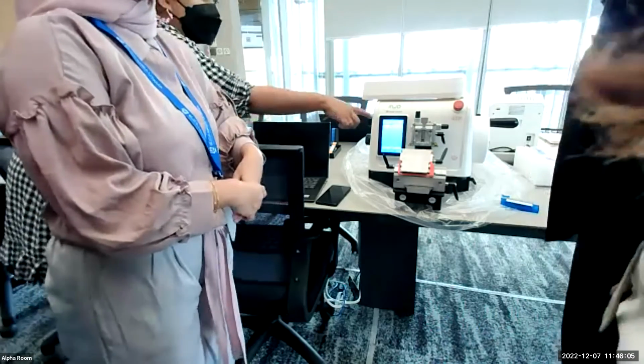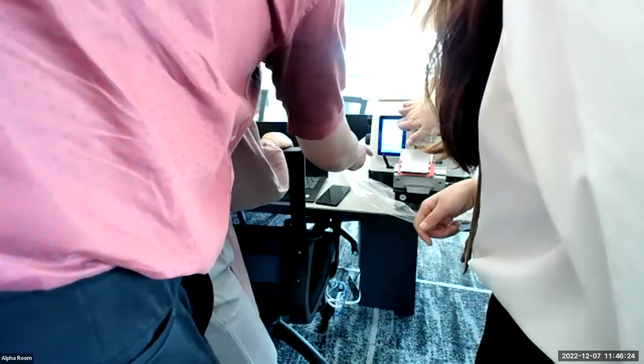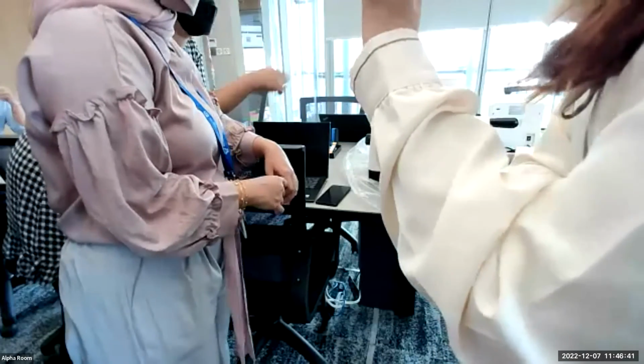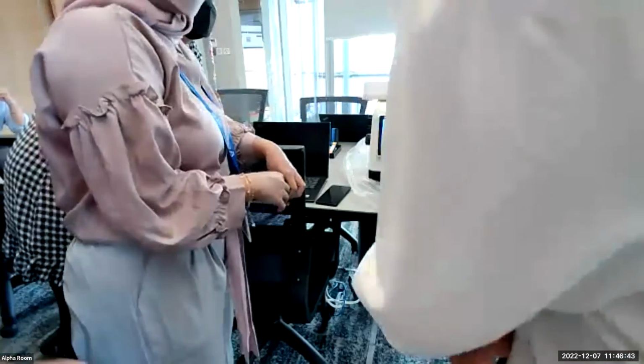So from the operation log, they set the parameters, and once they want to use the same setting again, they just recall the program from the operation log.